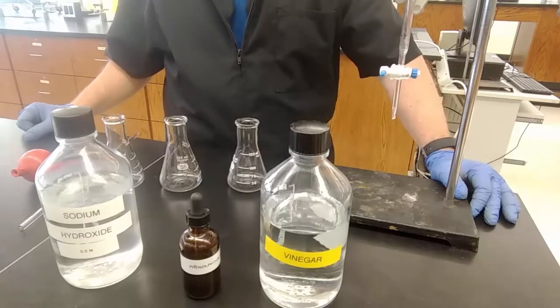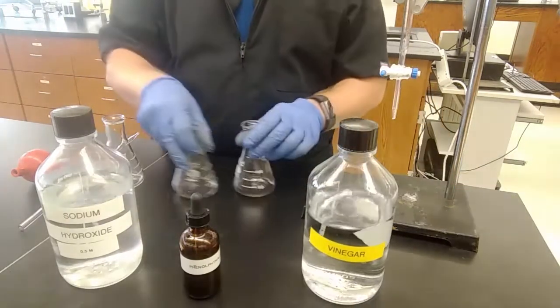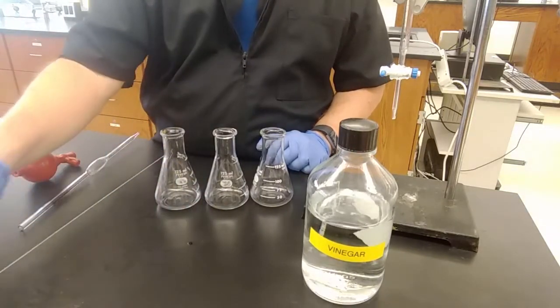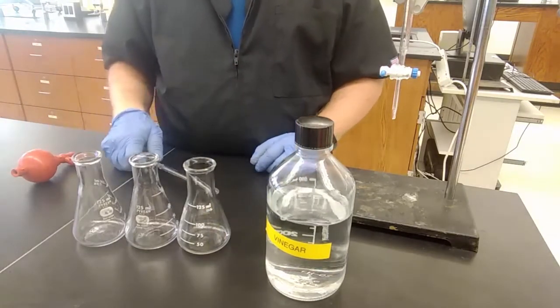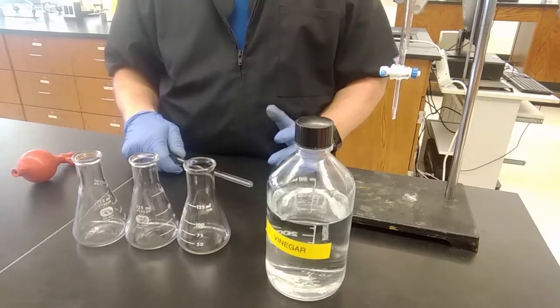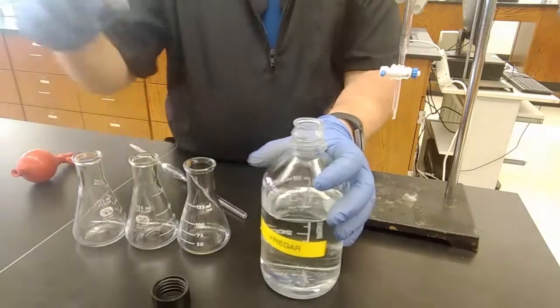So here we go. It says take 30 milliliters of vinegar and add it to a 100 milliliter beaker and then take 10 milliliters into three Erlenmeyer flasks. Since I'm the only one doing this today in here, we can go straight to the pipetting 10 milliliters into three Erlenmeyer flasks. We're just going to do the experiment three times to make sure that we can confirm our result, which we learned in the pH lab can be pretty important. So cap up like usual.